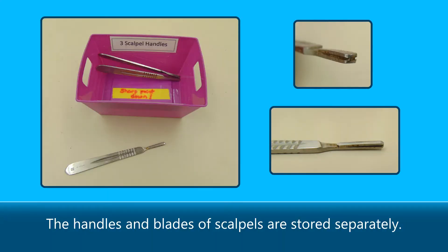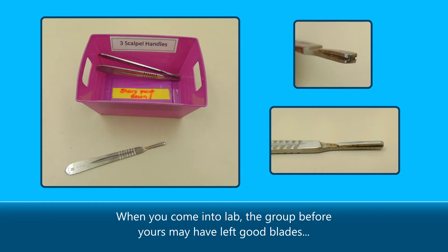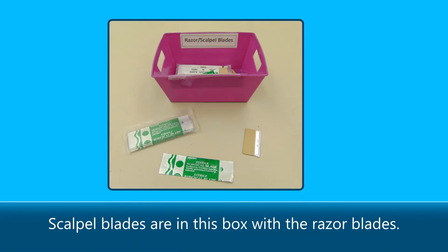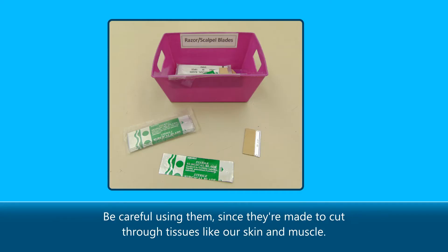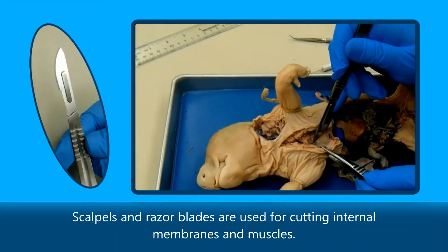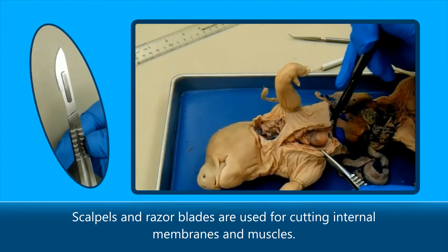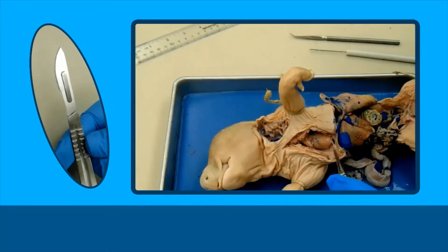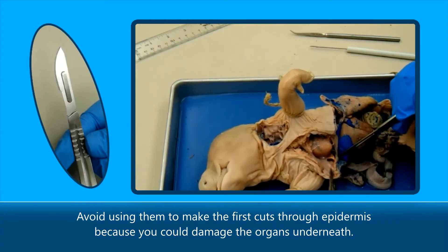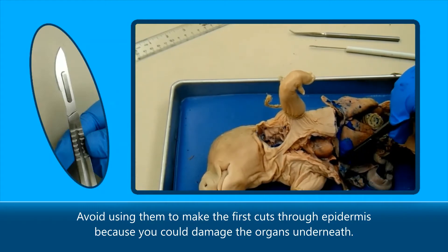The handles and blades of scalpels are stored separately. When you come into lab, the group before yours may have left good blades on the scalpel handles, or you may need to attach new blades yourself. Scalpel blades are in this box with the razor blades. Be careful using them since they're made to cut through tissues like our skin and muscle. Scalpel and razor blades are used for cutting internal membranes and muscles. Avoid using them to make the first cuts through epidermis because you could damage the organs underneath.